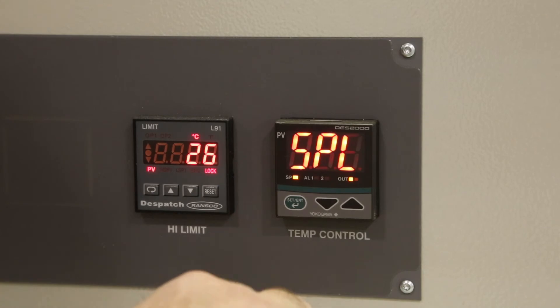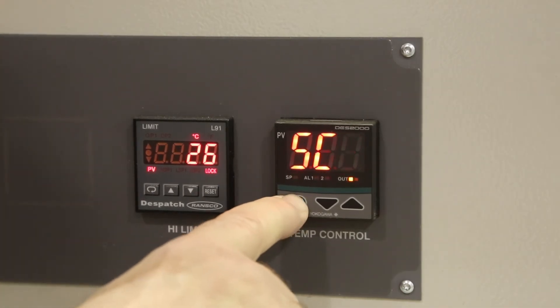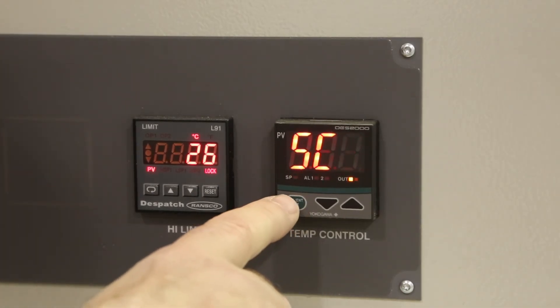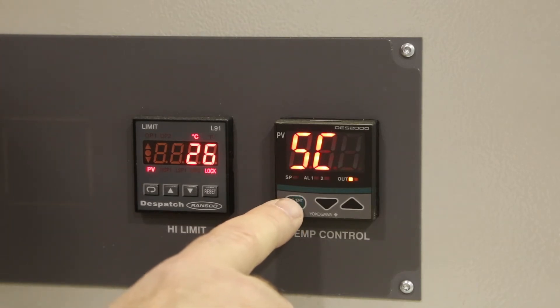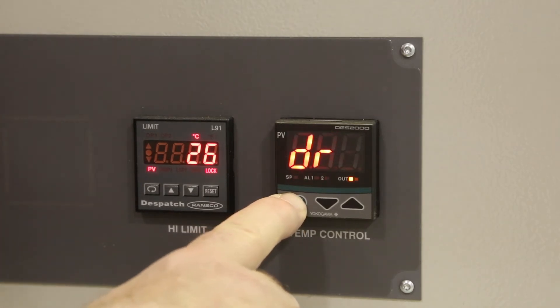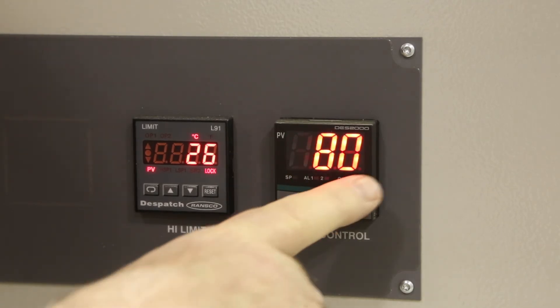Press the green button until you see SC. The rest of the values are unimportant at this point and we can return to normal operation. Press and hold the green button, which will take you back to the set point and will show the current temperature of the oven.